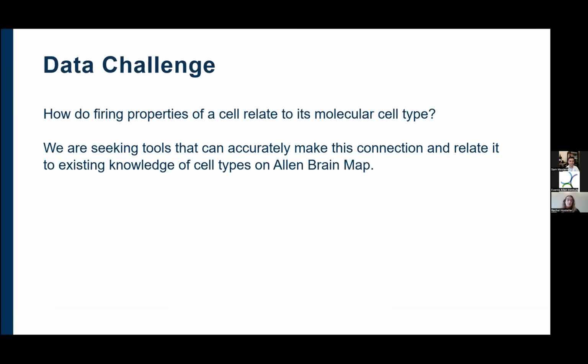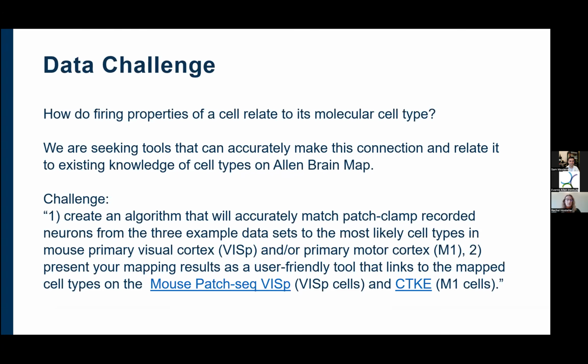One way of doing that is through a technique called patch-seq, where you're able to patch from a cell, record it, and then extract the nucleus and get sequencing data from it. Those are some experiments that we do at the Allen Institute. The spirit of this challenge was, how do we collect and connect external patch data to this patch-seq data at the Allen Institute so that we can try to infer some of these transcriptomic identities to electrophysiologically recorded cells.